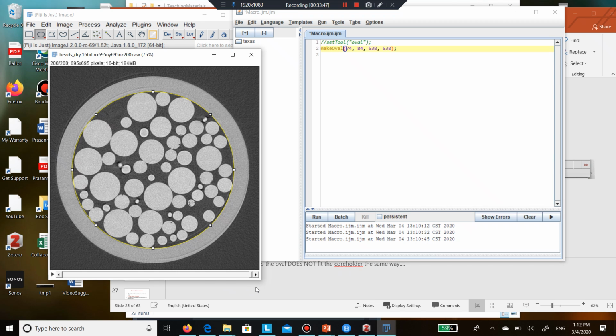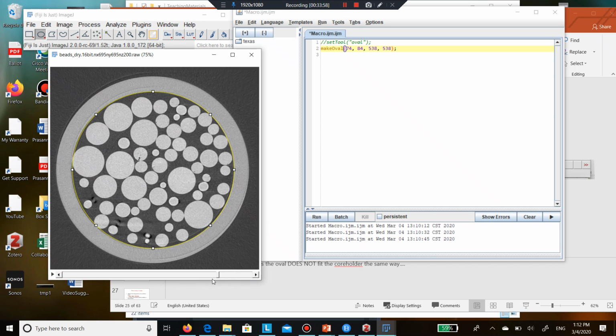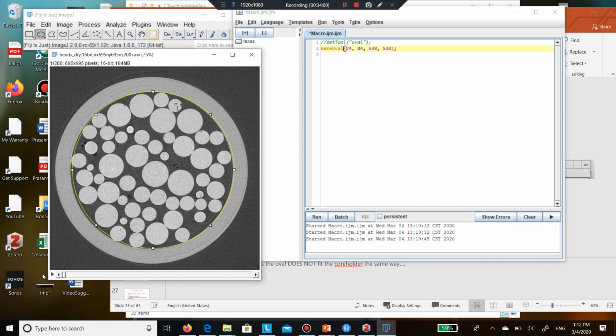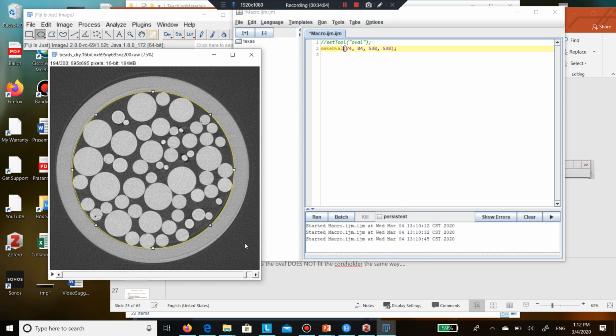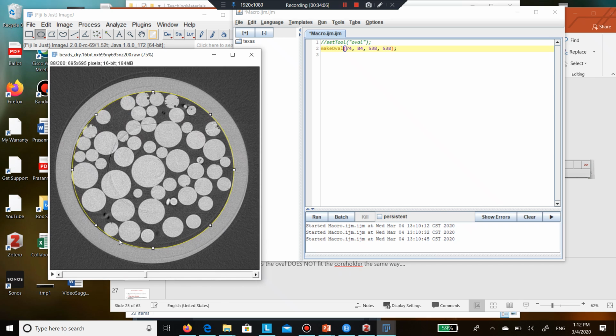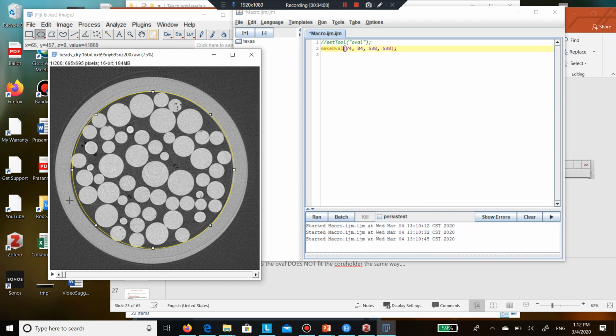Yes. You can, I guess, write an algorithm for doing that. So you can figure out, by placing this, what the shift is here and what the shift is here. And basically, there's a translation.